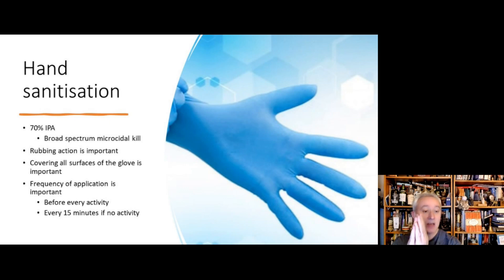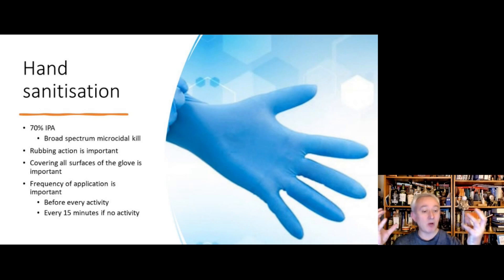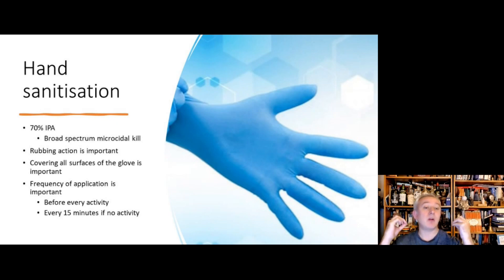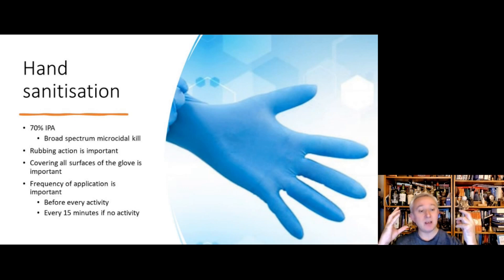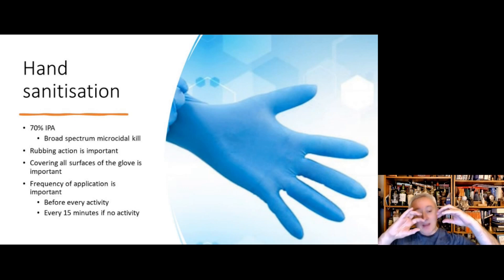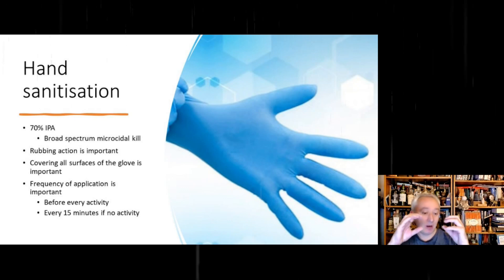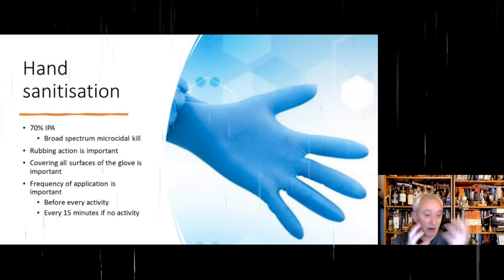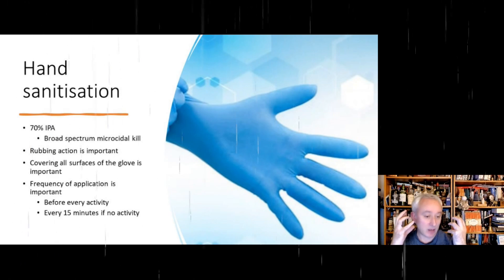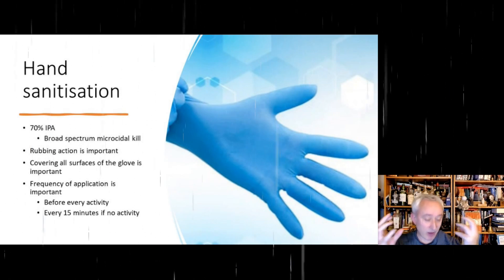Hand sanitization involves the application of 70% isopropyl alcohol, or IPA. This gives a broad-spectrum microbial kill. IPA penetrates the microbial cell wall and causes protein denaturation, stopping the mechanisms of the microorganism's cellular functions and preventing replication.